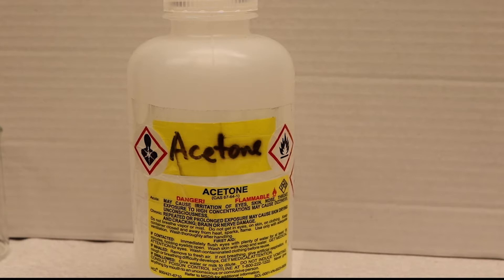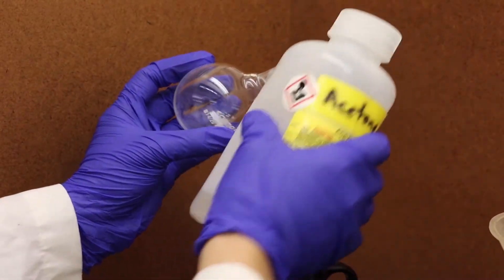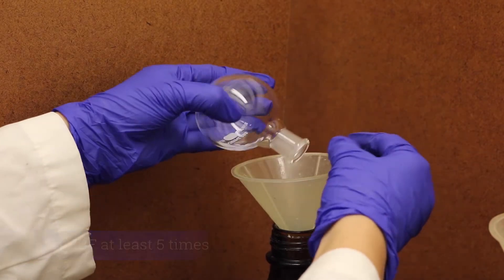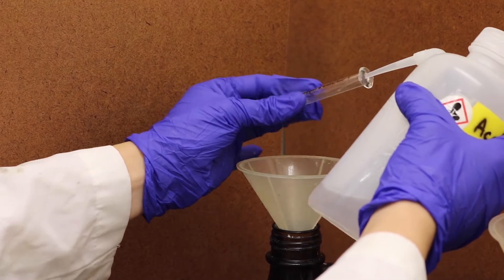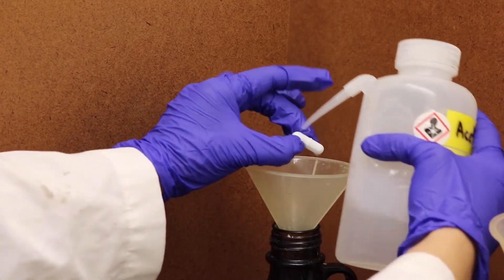The first washing agent used is acetone. Make sure to clean the inside of the 25ml round bottom flask by spinning the glassware at least 5 times. Dump the solvent into the non-halogenated waste. Next, the syringes and magnetic stir bar are washed as shown over the waste bin.